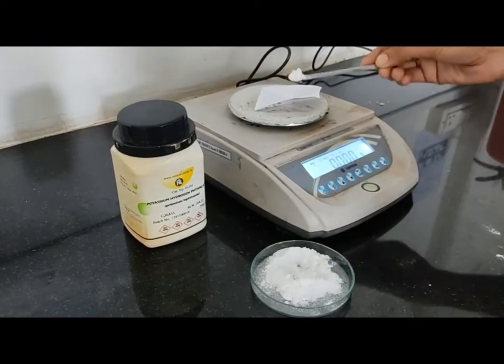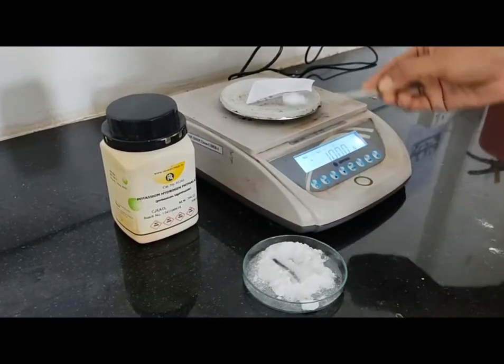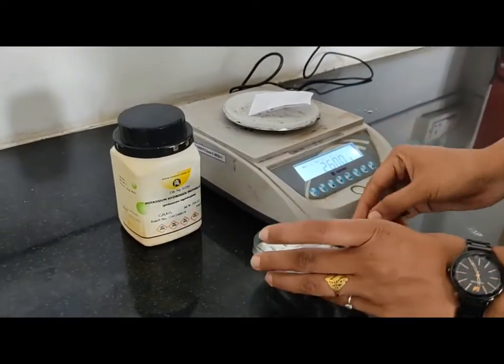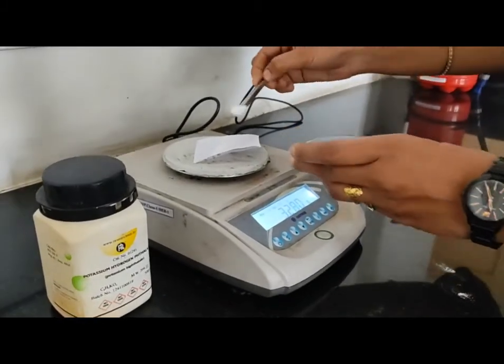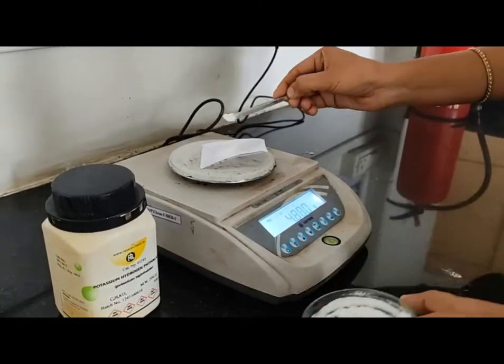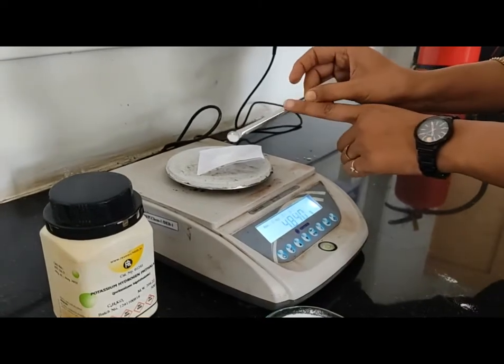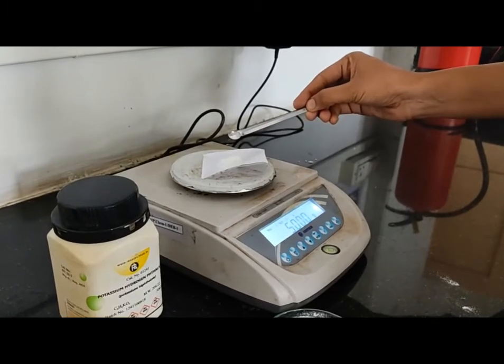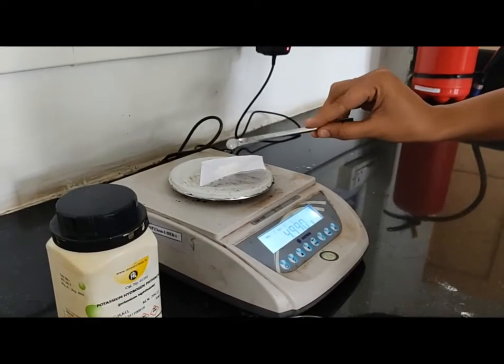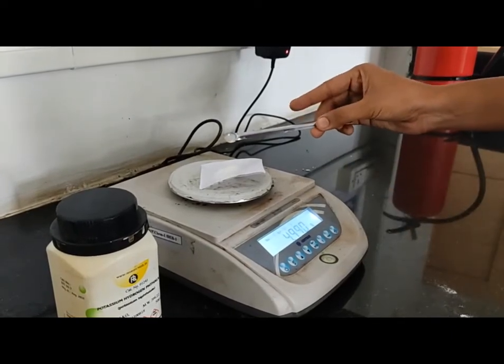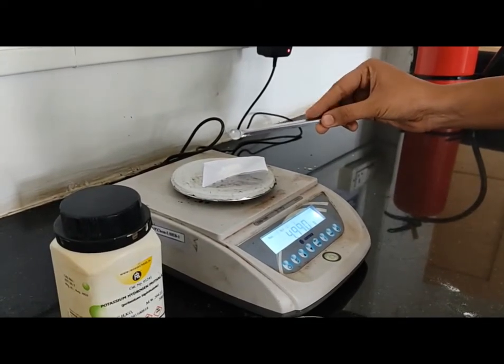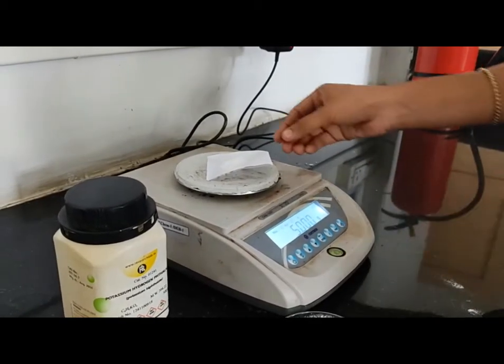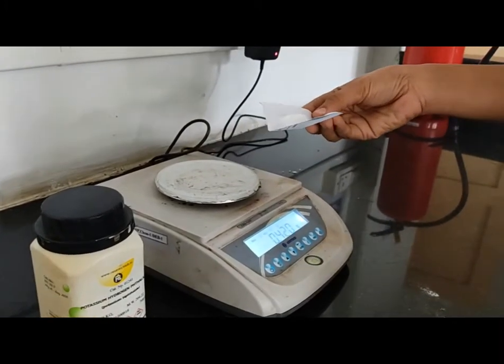Now for standardization purposes, we have to weigh 5 grams of potassium hydrogen phthalate. Let's measure 5g of potassium hydrogen phthalate.